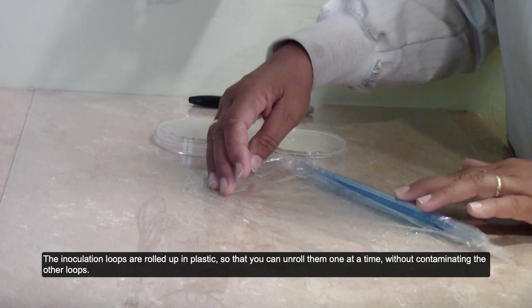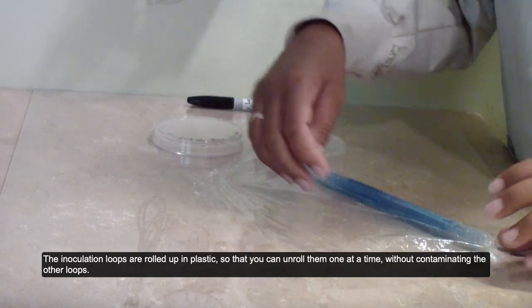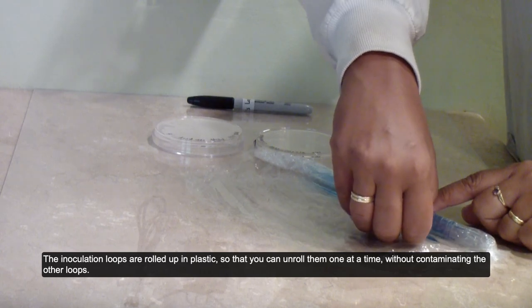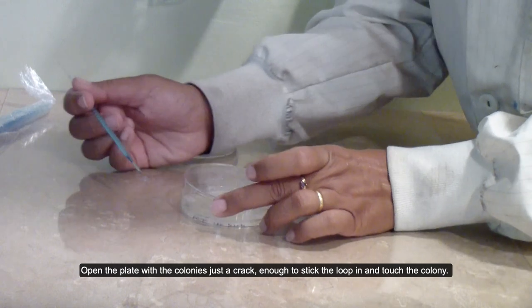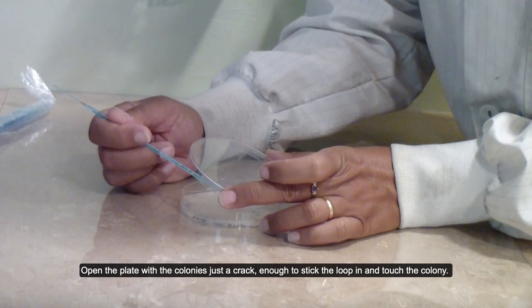The inoculation loops are rolled up in plastic so that you can unroll them one at a time without contaminating the other loops. Open the plate with the colonies just a crack, enough to stick the loop in and touch the colony.